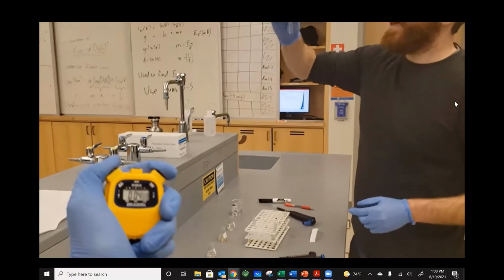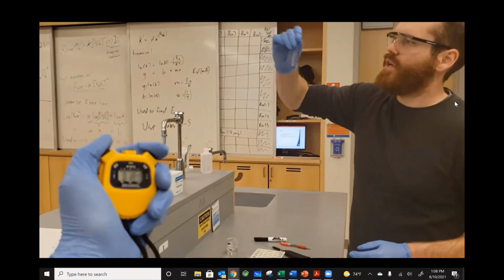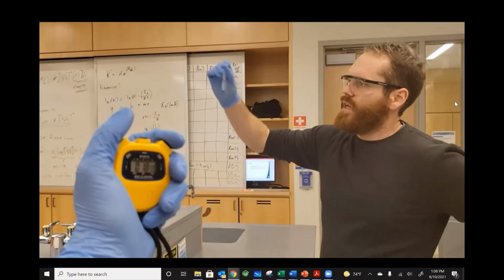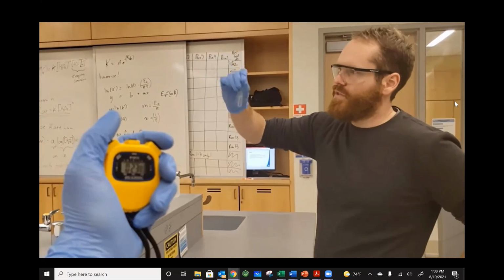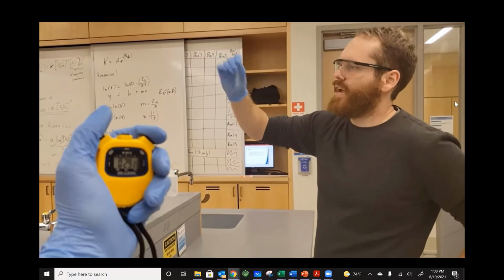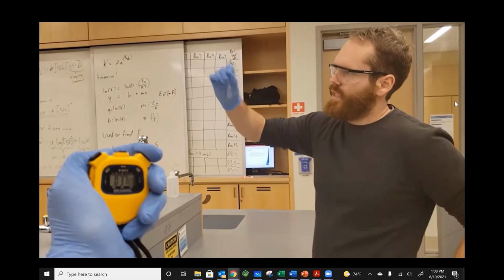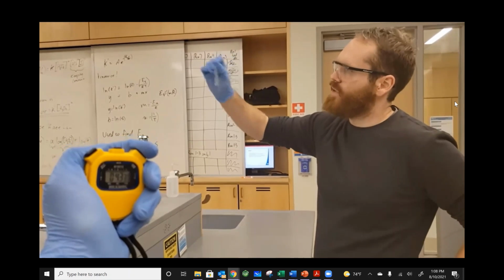Now what I'm going to be doing is agitating this properly until I see a color change, and then the stopwatch will stop. So I'm making sure everything is getting sloshed around in there. The two reactions are occurring simultaneously, and it should change after a certain amount of time. This agitation is extremely important. If you don't have proper agitation, the reaction will not occur in the actual time because you're not giving everything a chance to actually interact. The reaction will be almost instantaneous, or the color change will be instantaneous. The reactions are, of course, occurring.